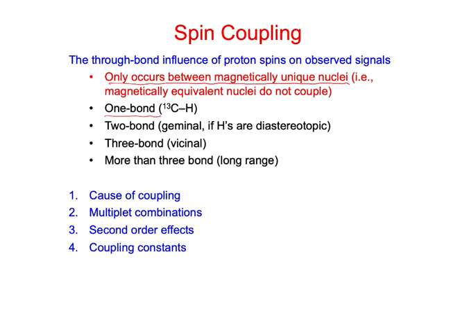These aren't the most common for proton NMR. We can have two-bond couplings. Okay, so these are going to be geminal protons, so protons on the same carbon, and this can really only happen if those two are non-equivalent. So in order to be non-equivalent, they have to be diastereotopic. It means we have to have some type of chiral center in the molecule to make them diastereotopic.